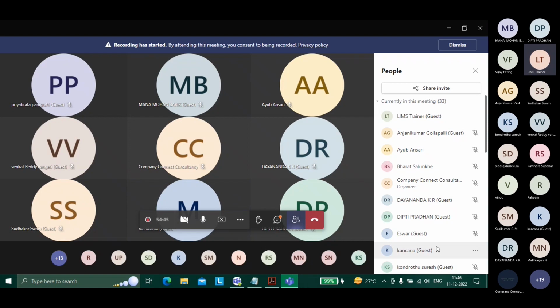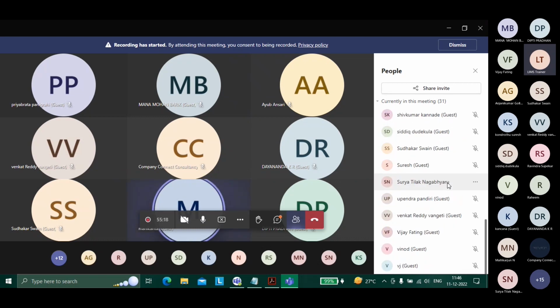One more point is that Smalltalk, no. I said you right, Labware uses its own scripting language which is built on Smalltalk. It has its own functions. So even I don't know Smalltalk. We are not able to see how the code is built at the backend using Smalltalk. But yes, we use LIMS basic code, LIMS basic functions. They use their own custom-made functions, maybe using Smalltalk. We don't know how they use those functions, but those functions are used as a part of LIMS basic. So in order to automate Labware LIMS from your end, you don't need to know Smalltalk.